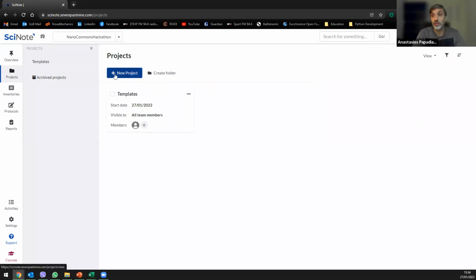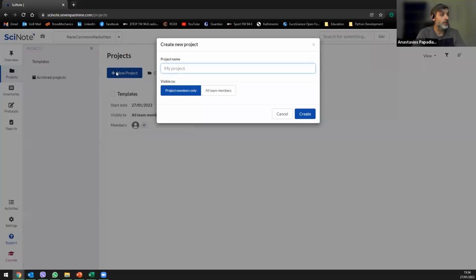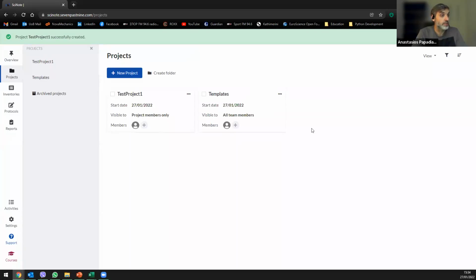So what you would do in this case, if you want to follow along, is create a new project, and you can call it, say, test project 1, and then you create a project. And this is added here.